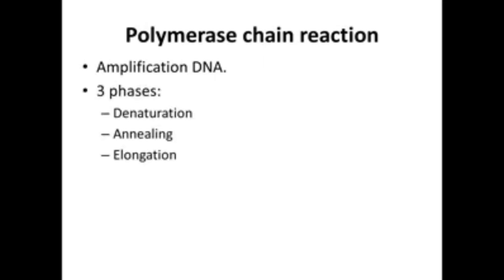The PCR, or polymerase chain reaction, is a laboratory technique used to amplify DNA. It consists of three phases: the denaturation, the annealing, and the elongation, that are different by the temperature used and the process that occurs in each one of these phases.